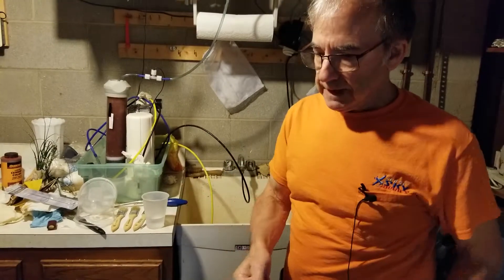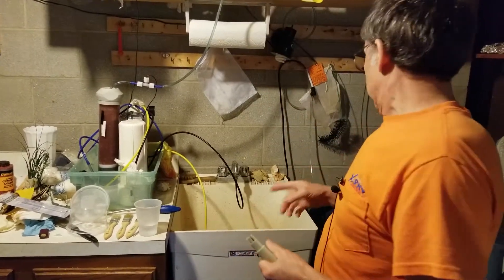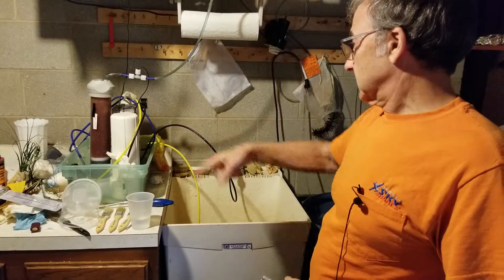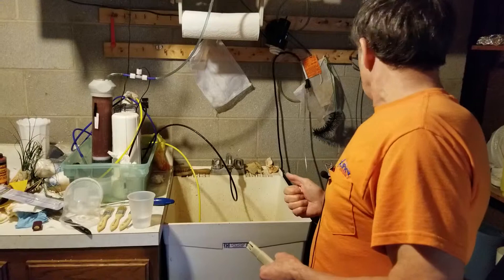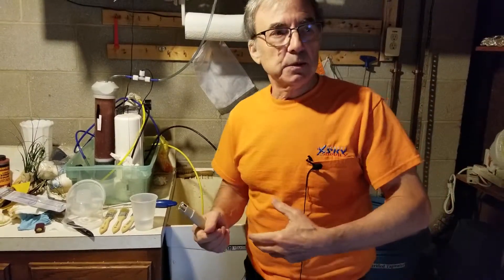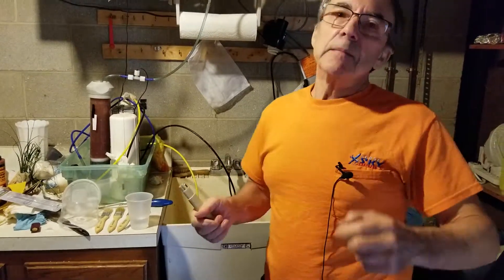It's a useful tool. It seems accurate in the sense that zero is what I would expect to get out of this four-stage filter, and 64 parts per million is about what I would expect from my tap water. Given that I've measured it a different way with the general hardness test, and that's correlating with this reading, I'm confident it's in the right range.